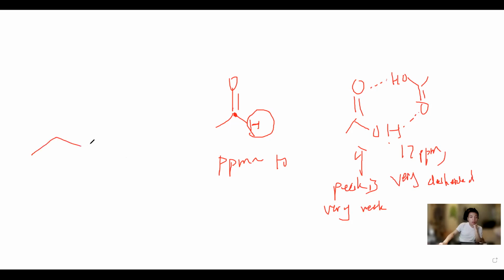So typically, whenever you see an alcohol or amine, these two are exchangeable.